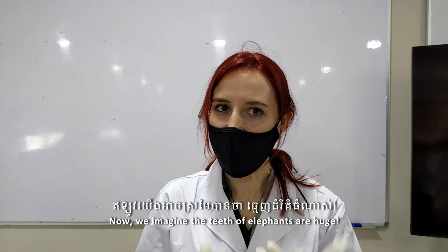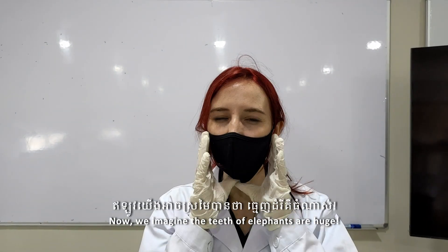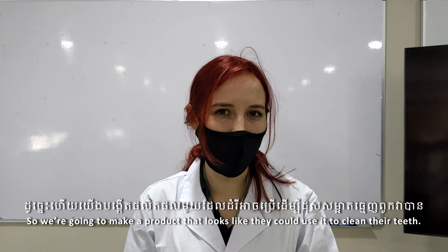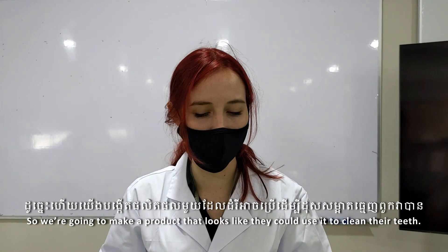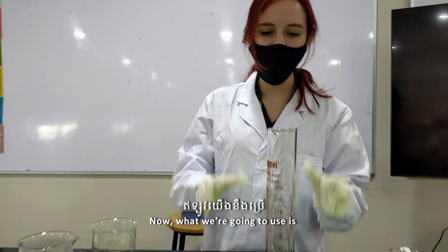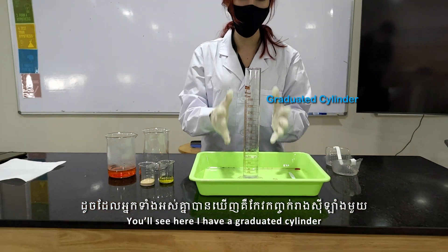We imagine that the teeth of elephants are huge, so we're going to make a product that looks like they could use it to clean their teeth. We're going to use — you'll see here I have a graduated cylinder.